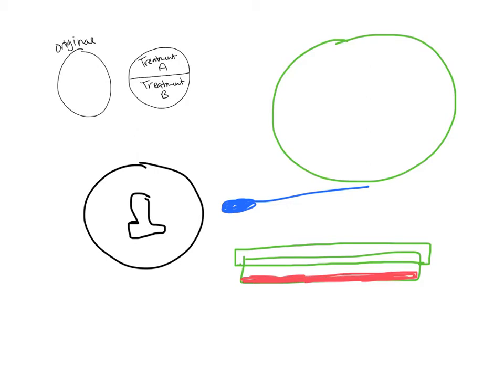So what you want to do is label on the bottom of the plate, so the side that the agar is on. And the way you'll label is around the edge. You'll put your initials, and then you'll put your environment.